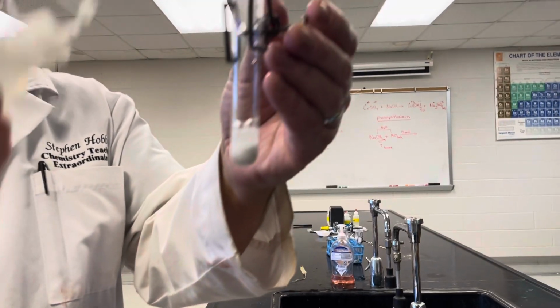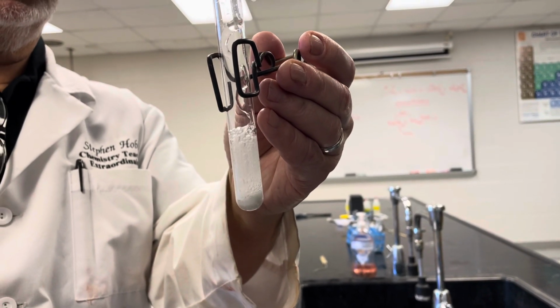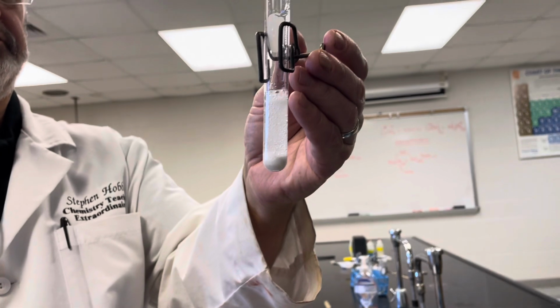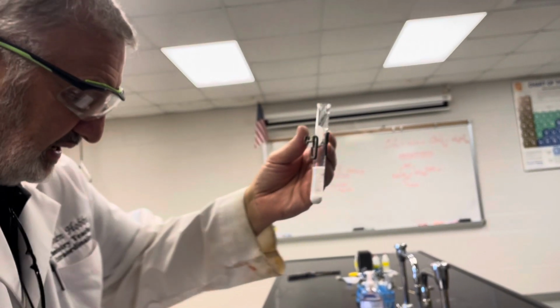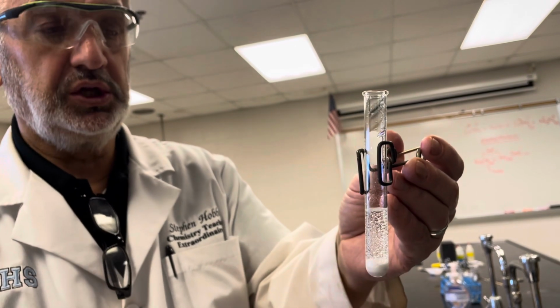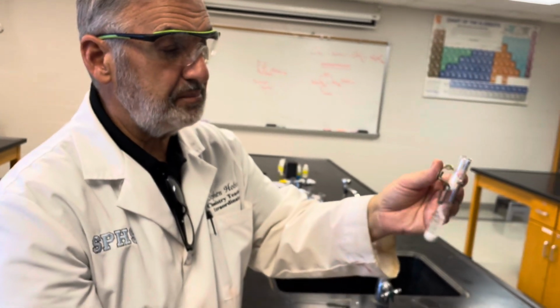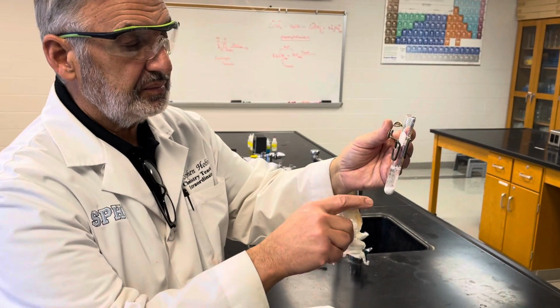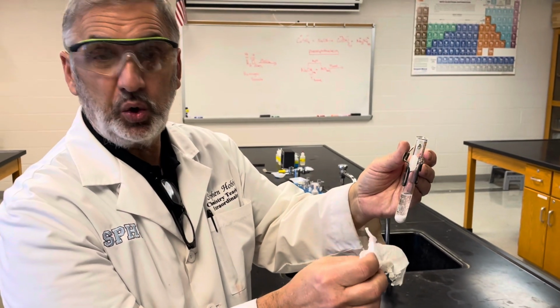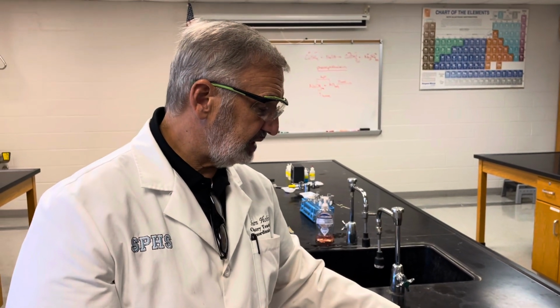When we put this in, again, you can see bubbles being formed immediately. Okay, it's bubbling up big time. And then when I feel the bottom of this test tube, it actually feels cool. It's not hot. This one's actually getting a little bit cold. So we can see bubbles are being given off, and the reaction is getting cold. So those are our 6 types of reactions.